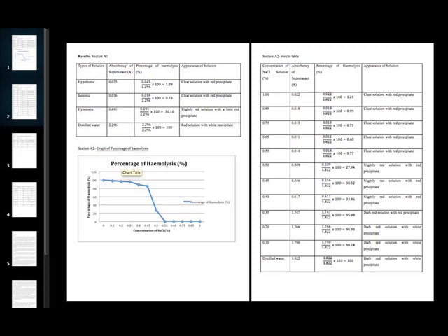The isotonic point, or the point of lysis, is determined based on the closest percentage of hemolysis to that of the reference isotonic solution. Based on our evaluation, we think that 0.55% sodium chloride concentration should be the point of lysis, with 0.77% hemolysis, although 0.75% sodium chloride concentration has a percentage of hemolysis much closer to that of the isotonic solution, which is 0.71%.